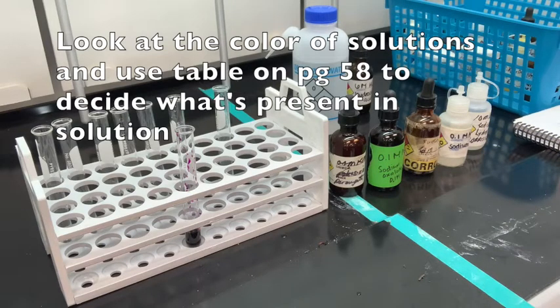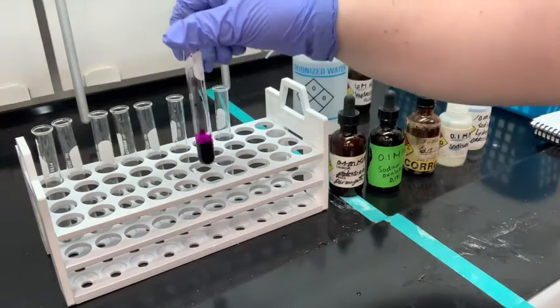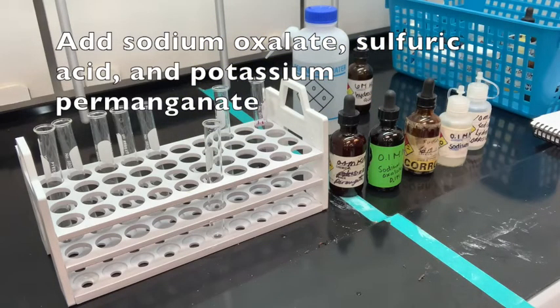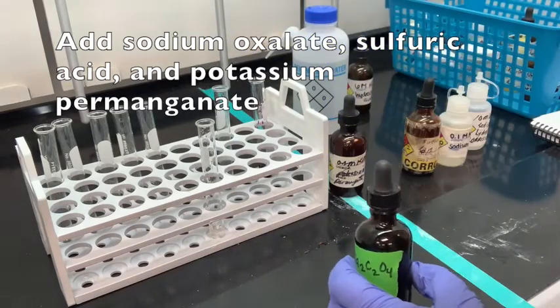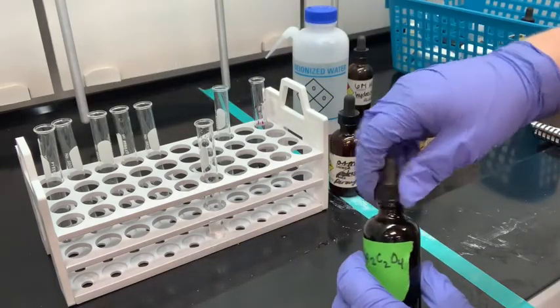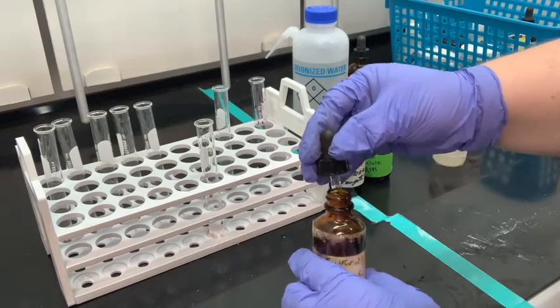The table tells us there are several different colors for any of these manganese oxyanions. The manganese oxyanion we're starting with is the permanganate, MnO4 minus. In my test tube — this was just so you can see the color — we're now going to add about one milliliter of sodium oxalate, then 10 drops of sulfuric acid.